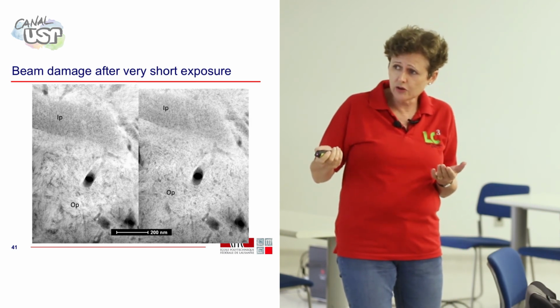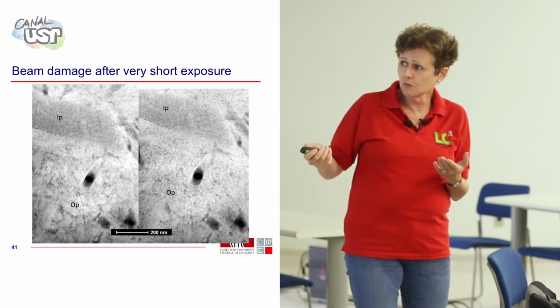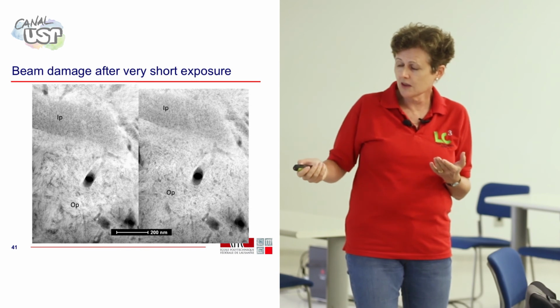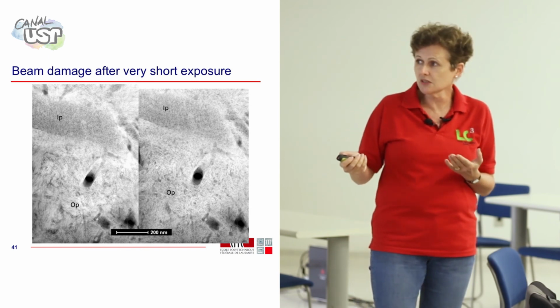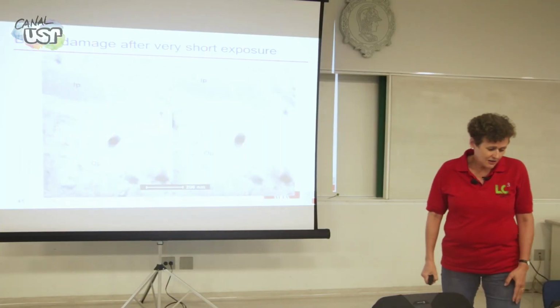And just look, here you can see you've got these nice fibrils, and already after a minute, when we took the same area again, you can see how these kind of bubbles are starting to develop. And if you look in published pictures, you can see 90% of them, they've got these bubbles. I even had the unfortunate experience of hearing somebody at a conference saying that these bubbles were the gel pores. But these bubbles are not the gel pores. These bubbles are damage.